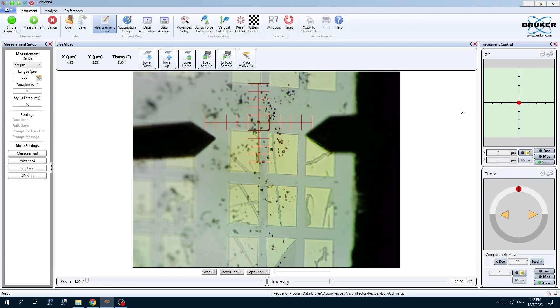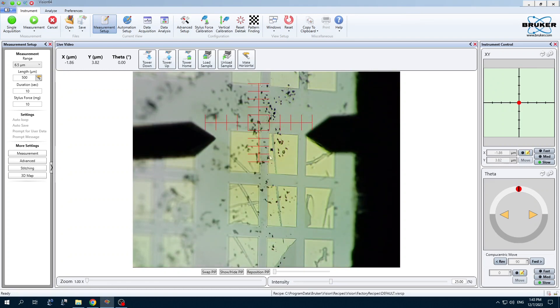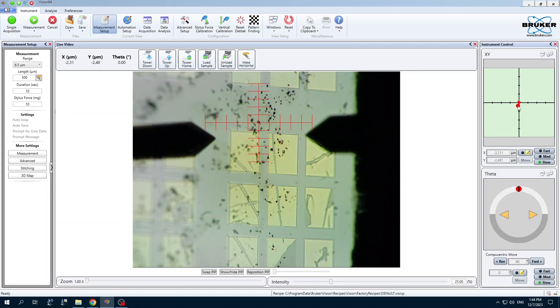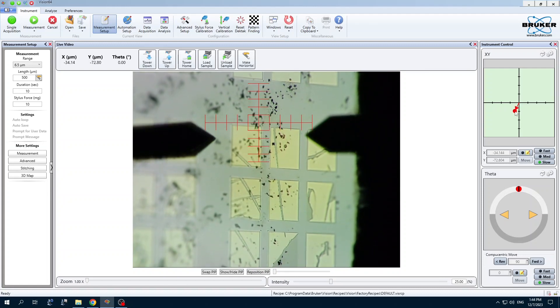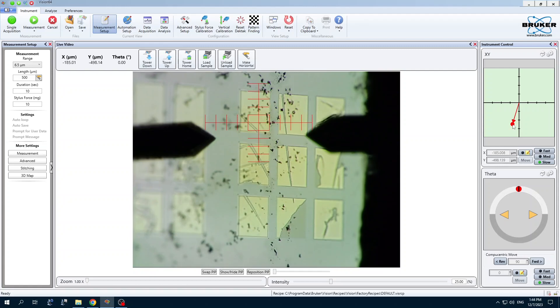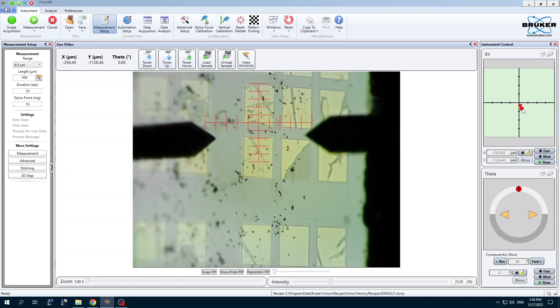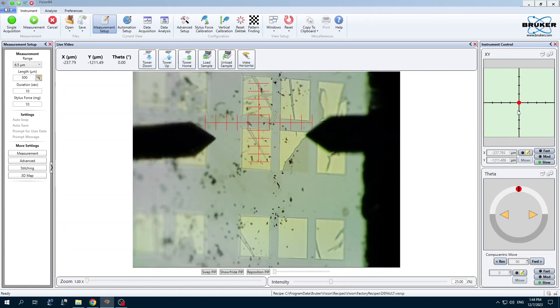Now with the tower down, we can position the Stylus to image the features we want to look at. I want to analyze this feature here, so I'm going to move the center of the crosshairs below that feature. We're going to scan in this direction here towards the top of the screen.